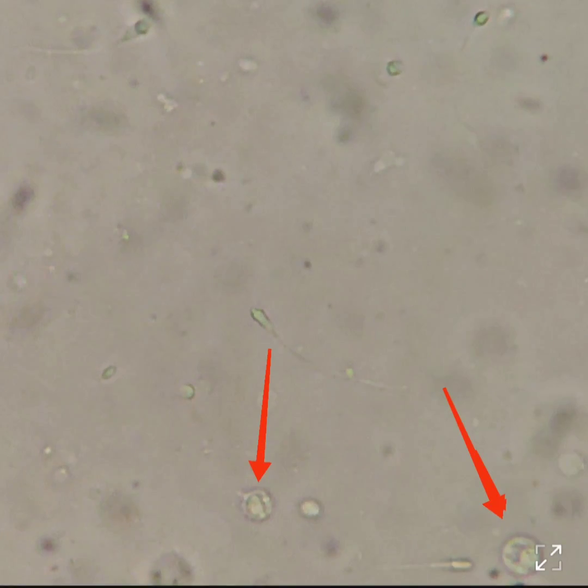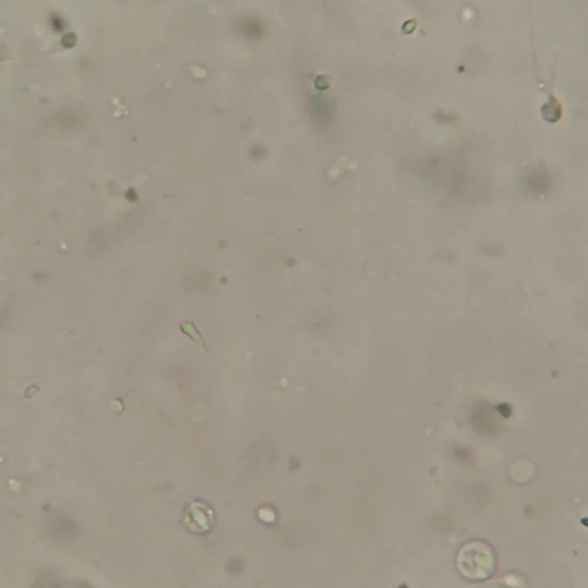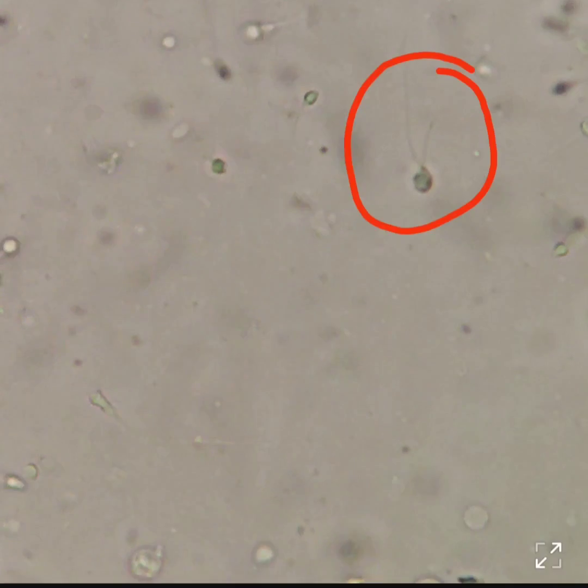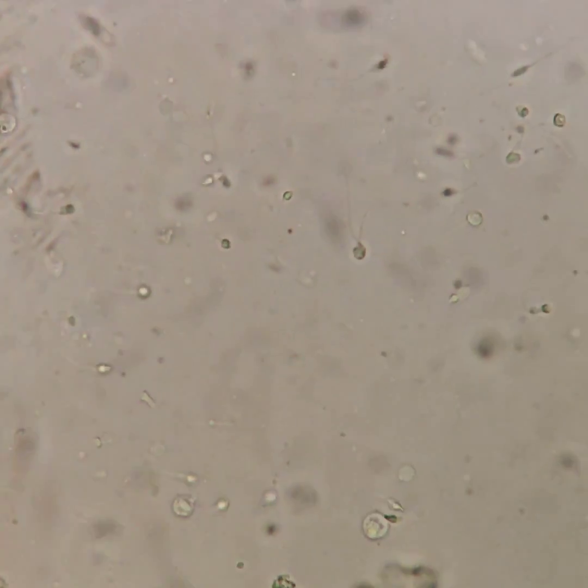You can see these cells. Don't be confused by these cells. These are not pus cells. These are spermatogenic cells which are shown by arrows. And this is the giant headed double tailed sperm.